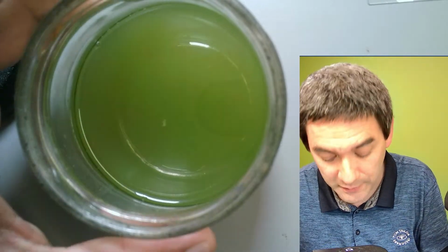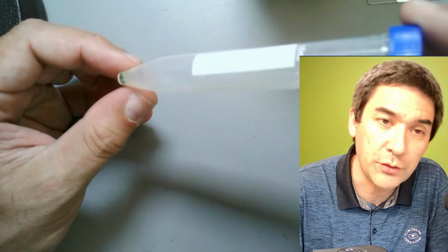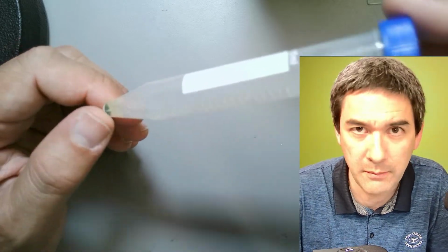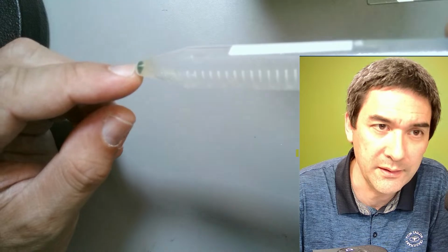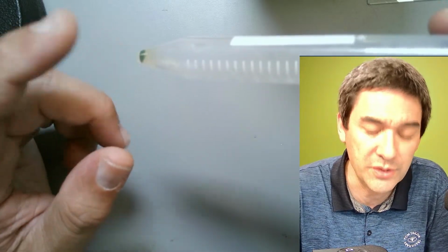And what I've done next is I have taken a tube, I filled it up, and I centrifuged it. For the sake of time, I'm not going to show you how I did that. But on the bottom here, you see this is a pellet. And this is basically whatever concentrated stuff was in there and a little bit of water. And what I'm going to do is I want to put this under the microscope. And before I do that, I have to resuspend it.